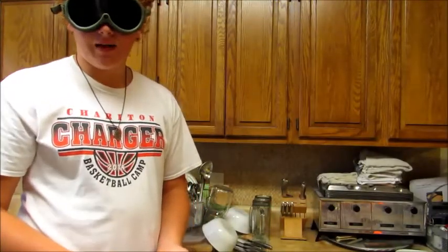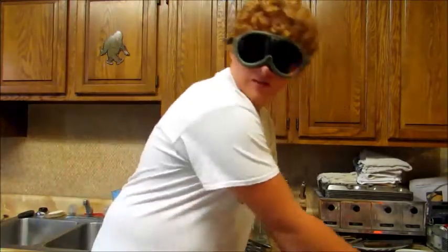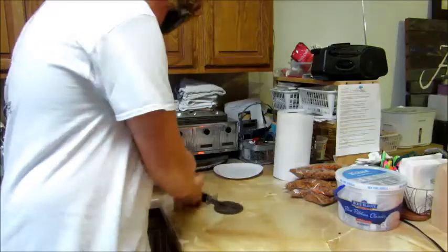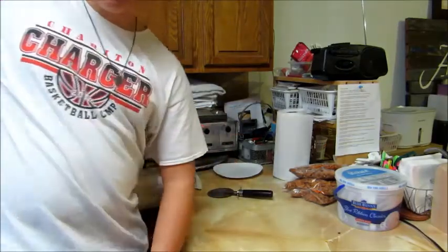Always clean up the lab, and dispose of sharp objects. Oh, it's time to go.